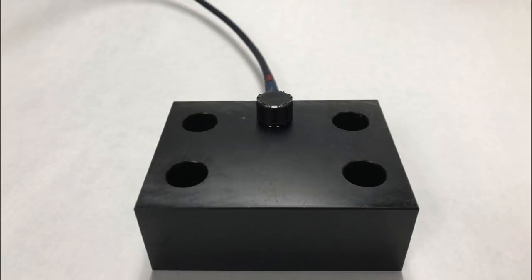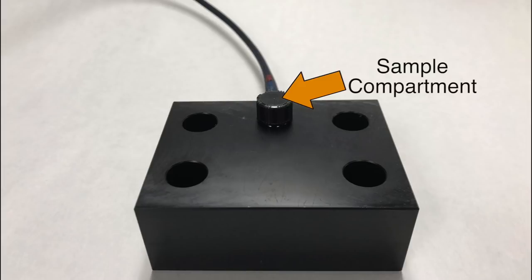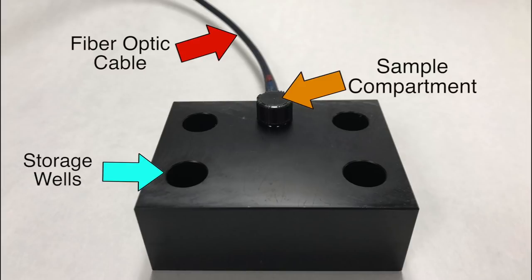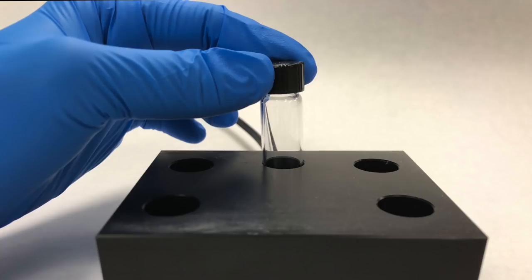The vial block you are using has one sample compartment and four additional wells to store other samples. Be sure not to move the vial block from its position as bending or stretching the fiber optic cables could break them. When you are ready to run a sample, wipe off the exterior of the vial with a kimwipe and place it into the sample compartment.